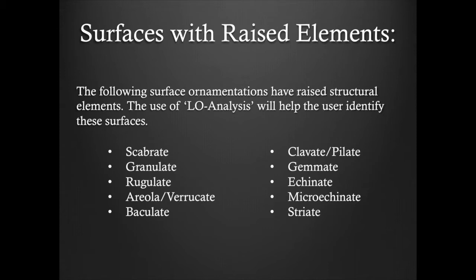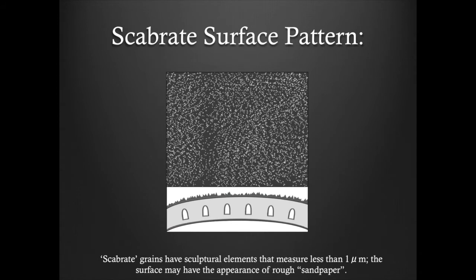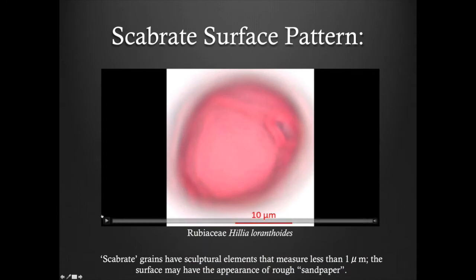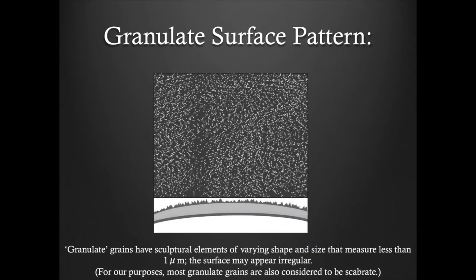The use of LO analysis will help the user identify these surfaces. Scabrate grains have sculptural elements that measure less than one micrometer. The surface may have the appearance of rough sandpaper. Granulate grains have sculptural elements of varying shape and size that also measure less than one micrometer. The surface may appear irregular. For our purposes, most granulate grains are also considered to be scabrate.